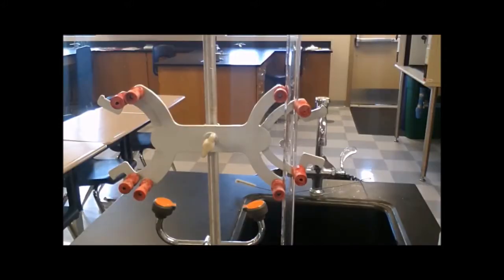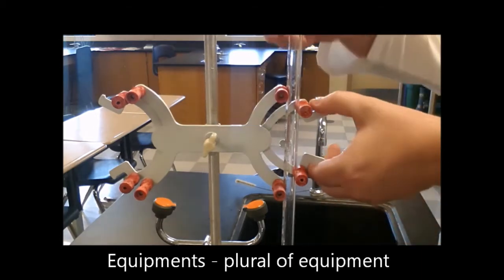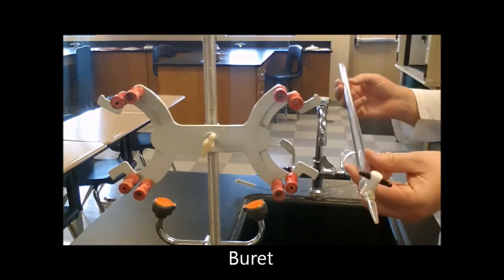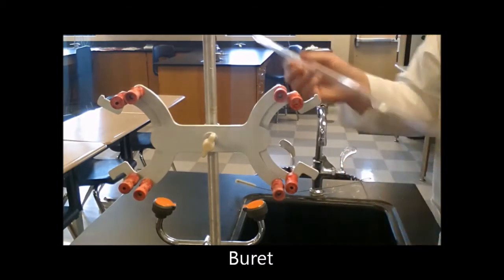All right, so I'm gonna make a video on how to do a titration experiment. First thing we need to go over is what the different equipment is named. So this is a Buret. You'll notice the Buret has several key features.